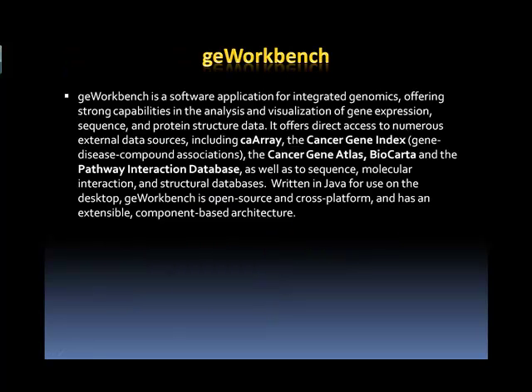Now, what's geWorkbench? geWorkbench is a software that integrates many genomics data analytical tools into one easy-access desktop application. It's free. At present, there are more than 70 available plugins supporting visualization and analysis of gene expression data, molecular interactions, DNA and protein sequences, and protein structures.